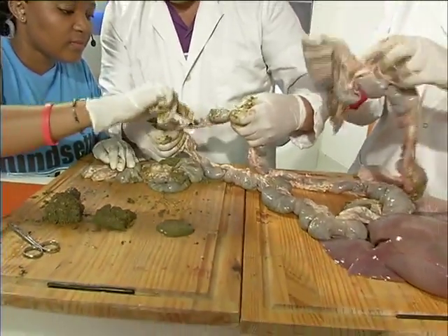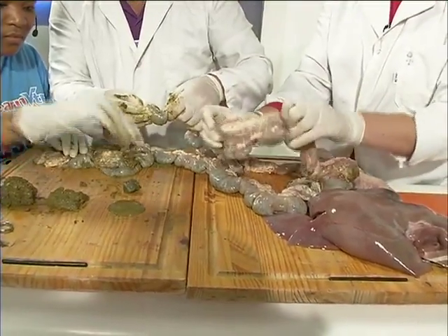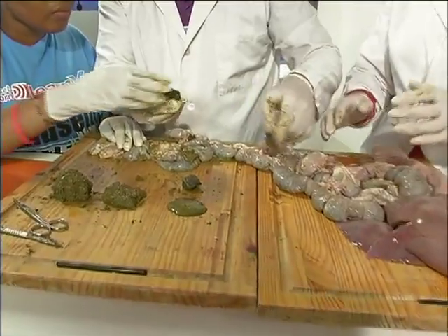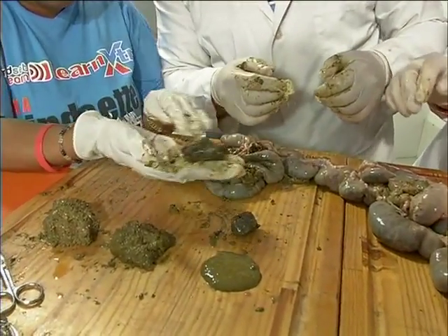That's it. Okay, is this fat? This is more fat. Yeah, there's got to be fat everywhere. There's more fat keeping it attached. Now, if you watch, when Lenny took that one, it broke very easily. Look how soft this still is. Okay, this is still soft. You can feel it. Right? Yeah, it's okay, still soft.